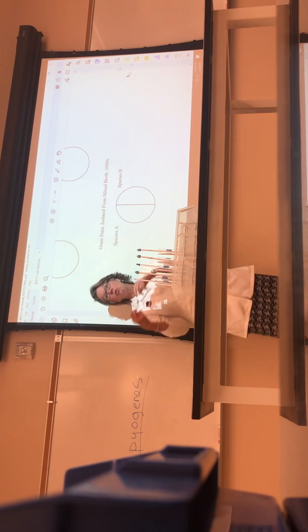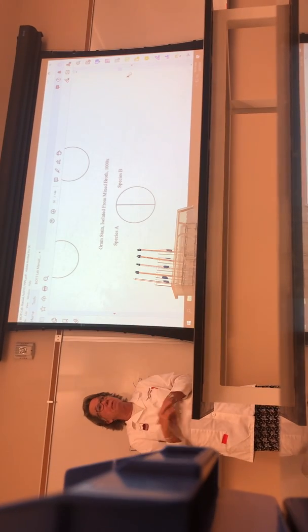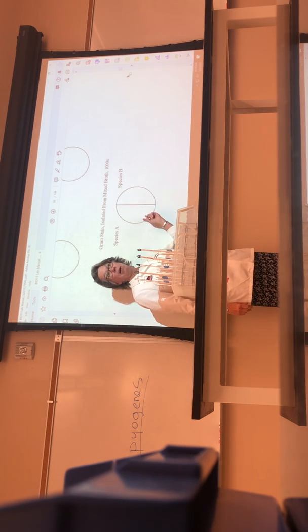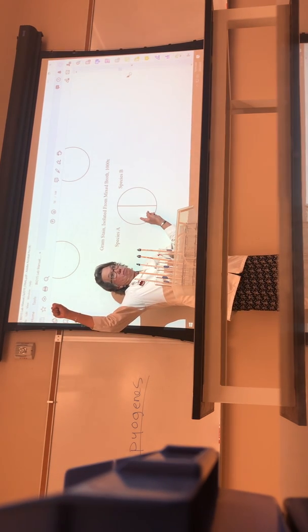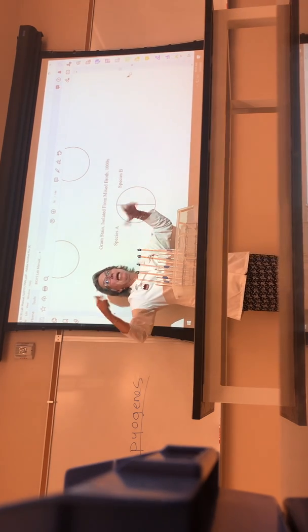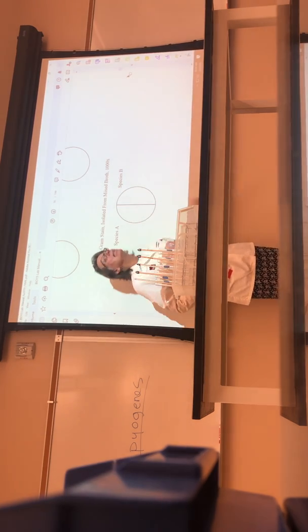Or that little transparent one is a gram negative rod. Again, I'm making this up. I don't know what your particular mixture is. So most of you have at least 1 drawing here. How many of you have at least 1 drawing in there? Good. Okay, so if you don't have any of this stuff, today's the day to get it. Okay, you should have saved your gram stains. So you have at least 1 of these.